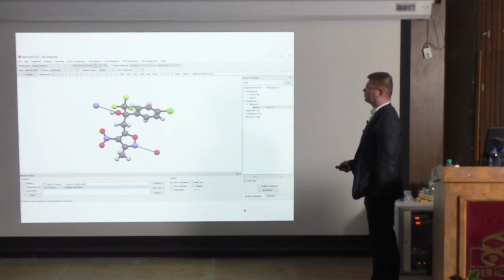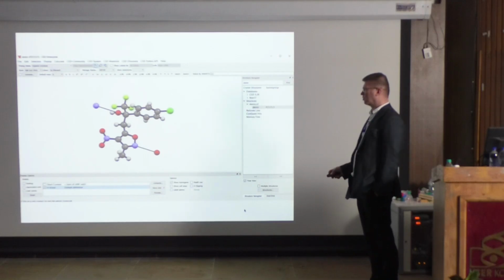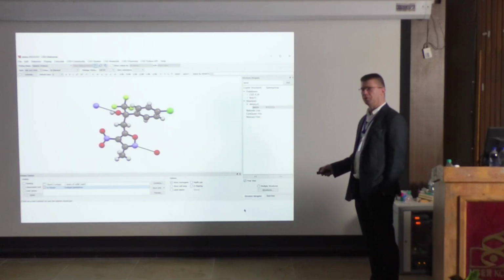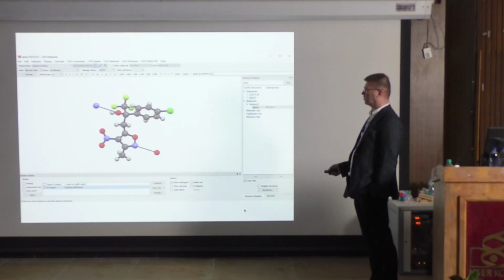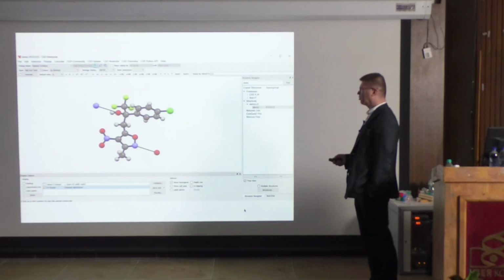But then you can also, inside this Mercury, ask it to look for the next molecules or hydrogen bonding. So there is a tick here, H bond, and when you use it, it will show the atom where it thinks is hydrogen bonded. As you can see, there's a dotted line, but there's an atom here, nitrogen, and an O atom here. So why is this? It only looks at the distances, it doesn't show them yet.